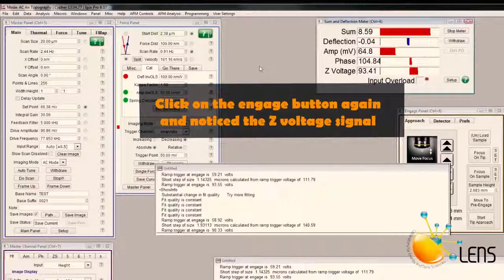Now you can start imaging your samples. You can go ahead and find the critical amplitude, which will give you control of the regime you want to image your samples. Next topic, we will be looking at how to perform the second calibration in preparation for force data acquisition.